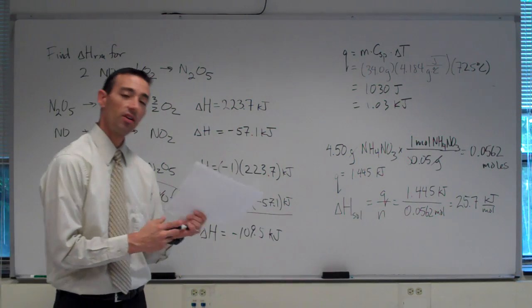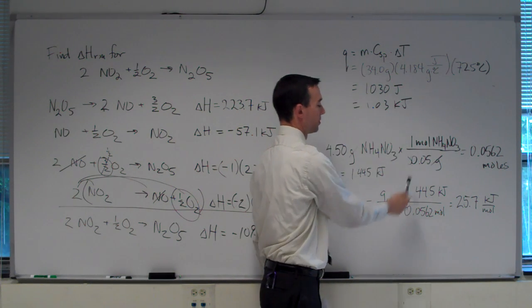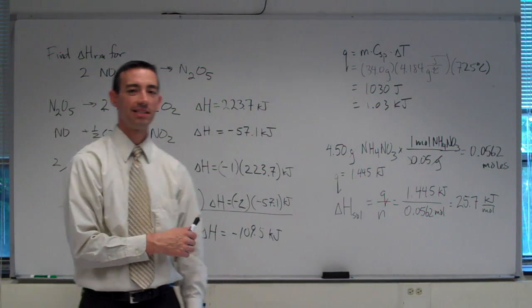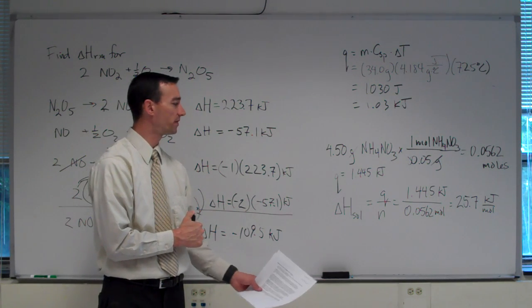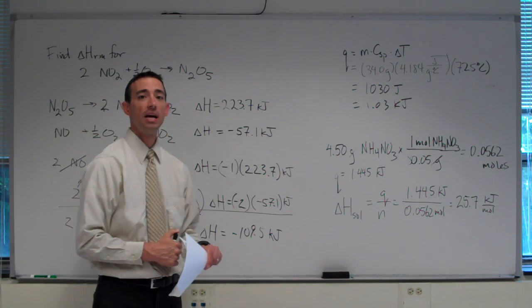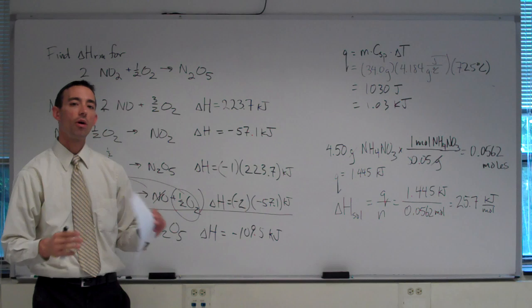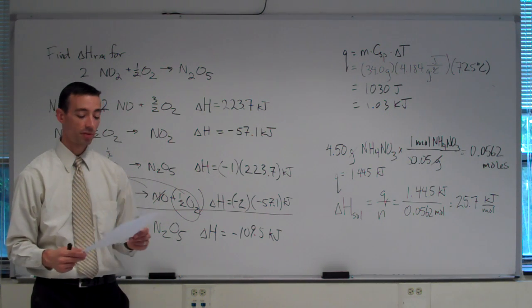In today's lab, you'll basically use the heat from a calculation like this to be the Q in this numerator, and then the moles would be your limiting reactant. Again, most likely your solid, your magnesium in the first example. And you're going to work with a couple of different reactions, as I said, magnesium and magnesium oxide, and then another different metal and its oxide to compare how much energy is involved in each of their formation reactions that you'll be looking at.